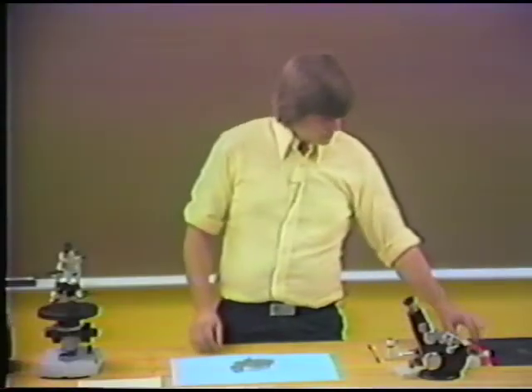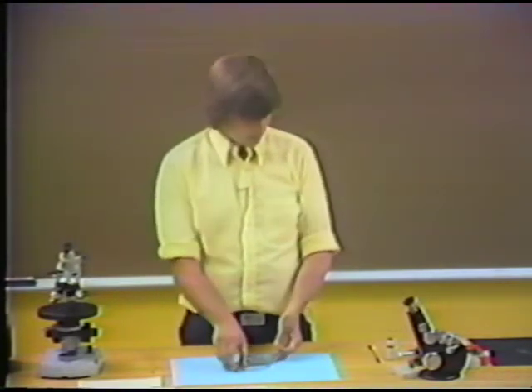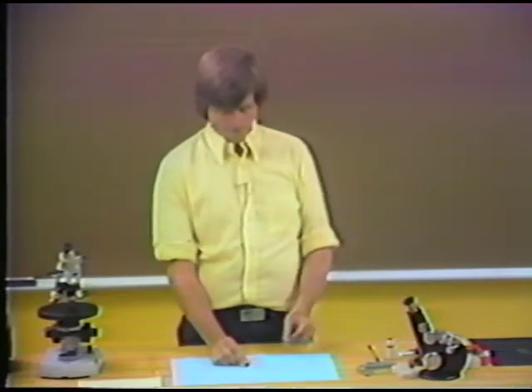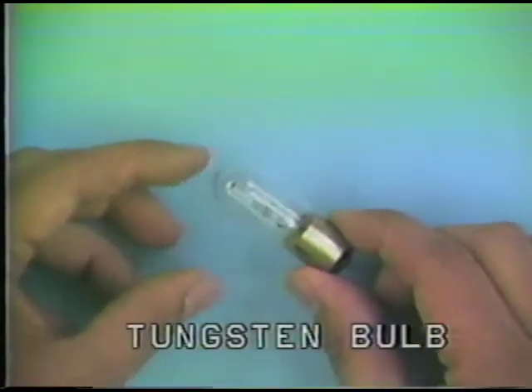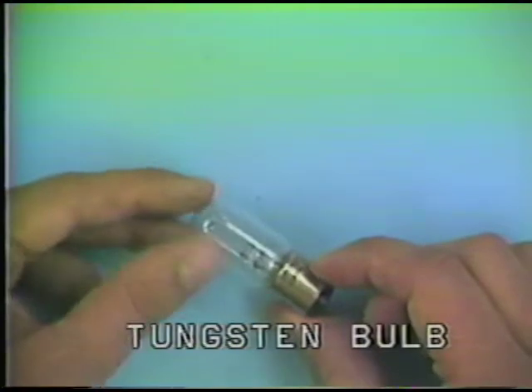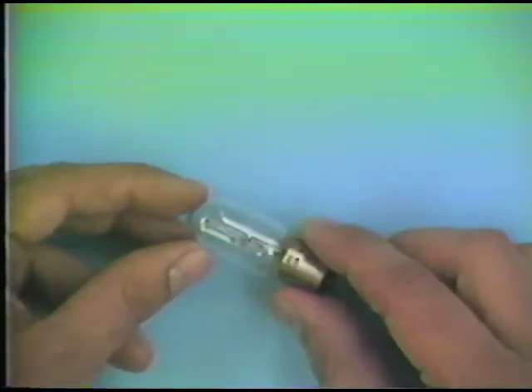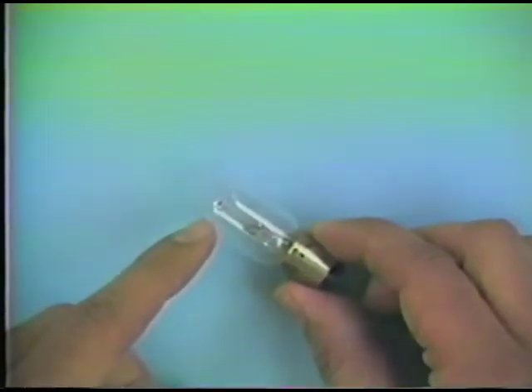Okay, the next thing I want to call your attention to is lighting of the microscope. And for lighting, we start with typically a tungsten light source. Here's a tungsten bulb which provides the primary light. Now, lighting is obviously critical for the specimen. If you're going to see it well, you have to have very good lighting. And so these are usually high-intensity tungsten bulbs.